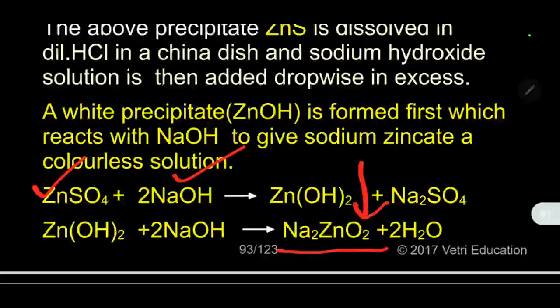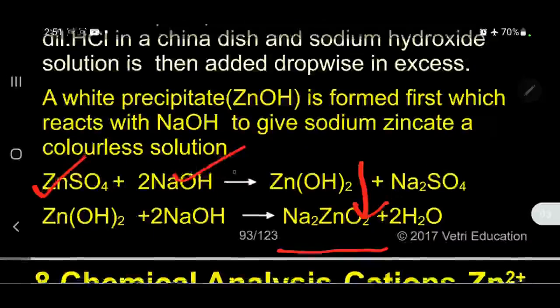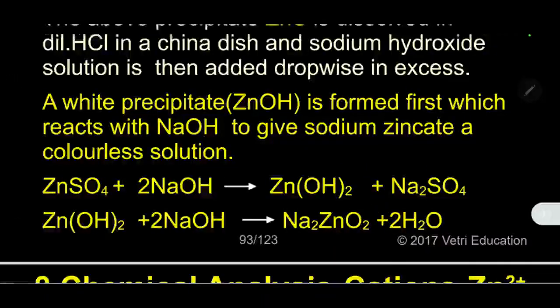which is soluble in water. It gives a colorless solution, which indicates the presence of the zinc 2 plus ion. I hope it is clear.